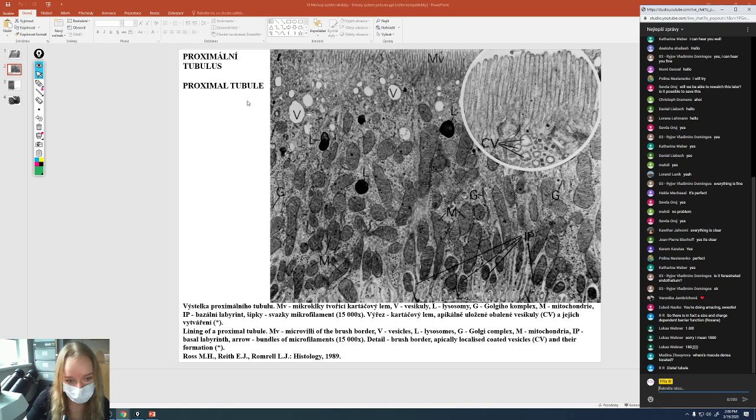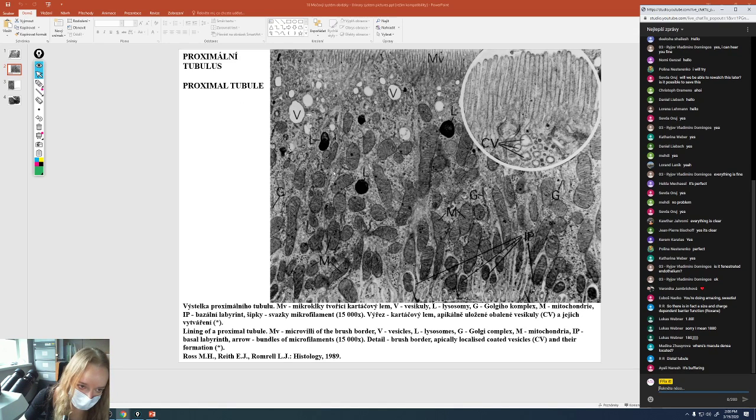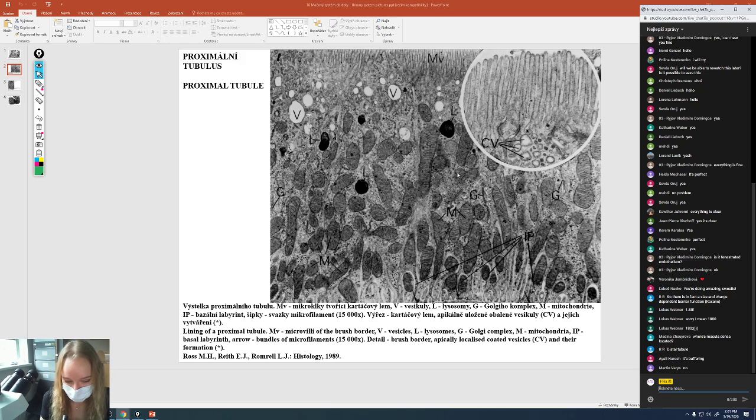This is the proximal tubule, and this is the section right through the part where we don't even see a nucleus. It's buffering. We're buffering. No. I don't see anything. It's something with your net connection. I know all the people No, right now are No, here is okay. all people right now are watching Netflix and stuff. So the internet is overpopulated right now. So maybe that's the case also at my home. The internet is not going right.